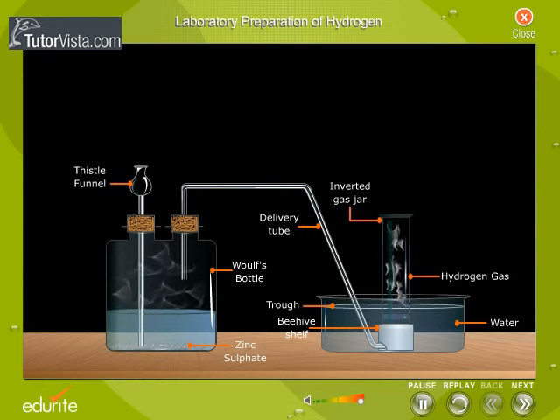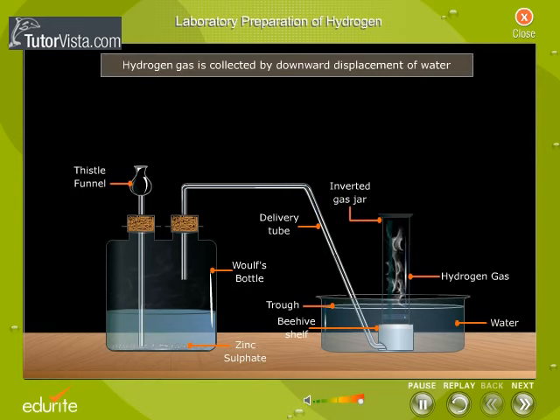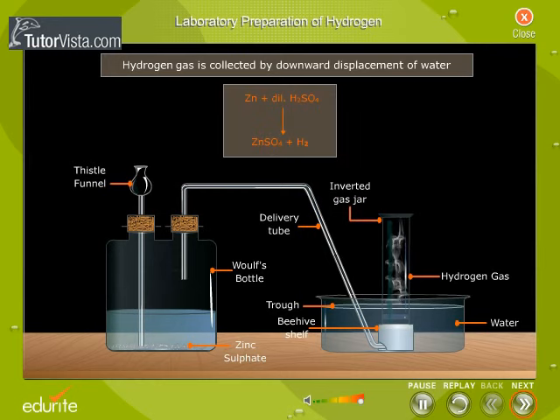Moreover, hydrogen forms an explosive mixture with air, and it is therefore safer to collect it over water. The reaction is represented by the chemical equation shown here.